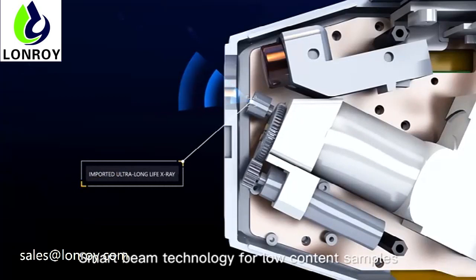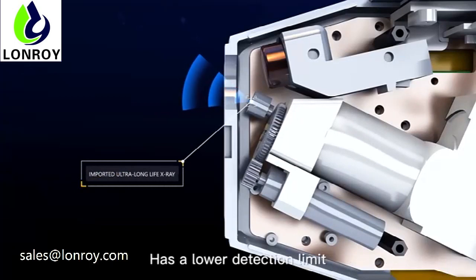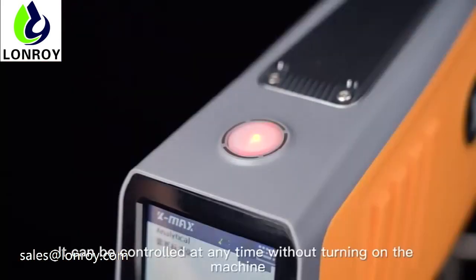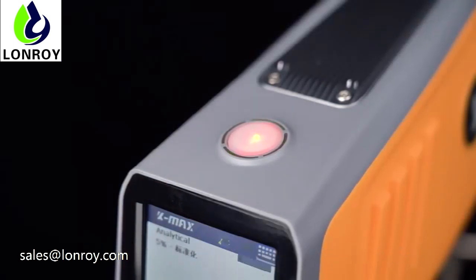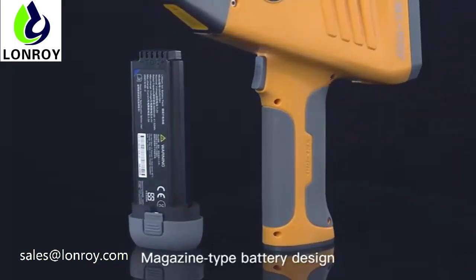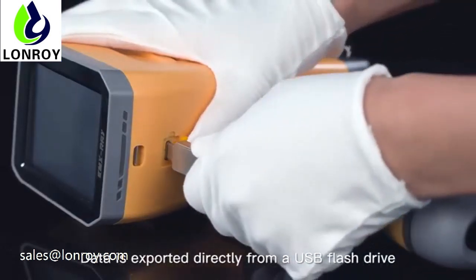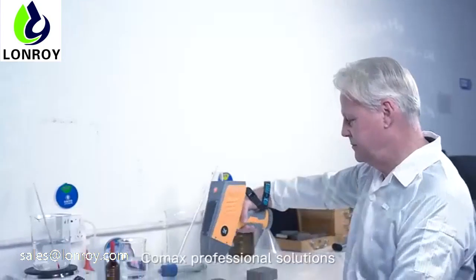Smart beam technology for low-content samples has a lower detection limit. External power design allows the instrument to be controlled at any time without turning on the machine. Magazine-type battery design, and data is exported directly via USB flash drive.